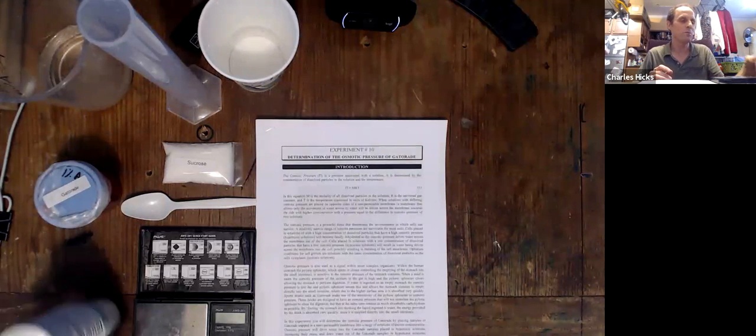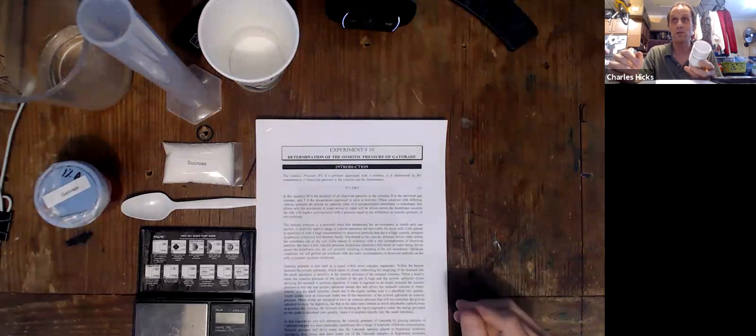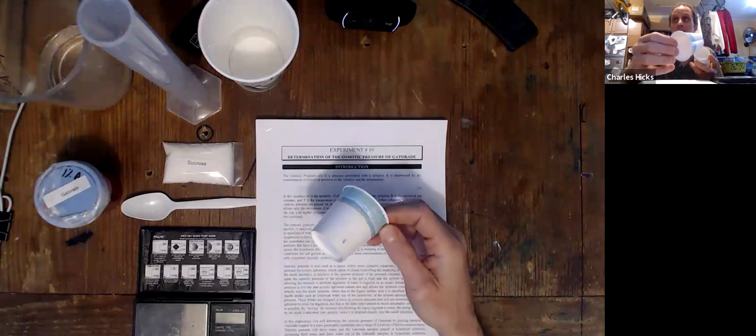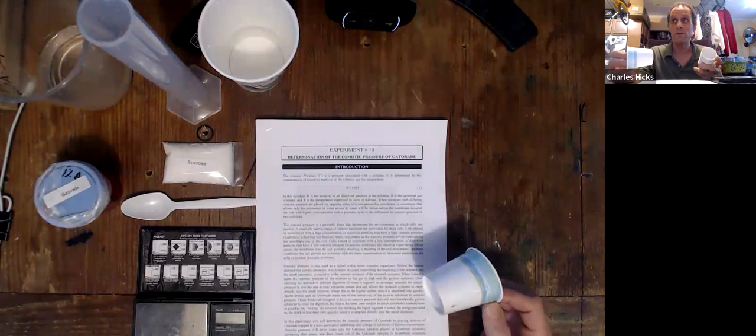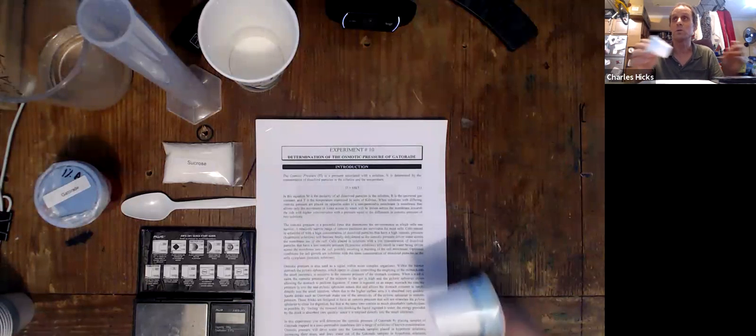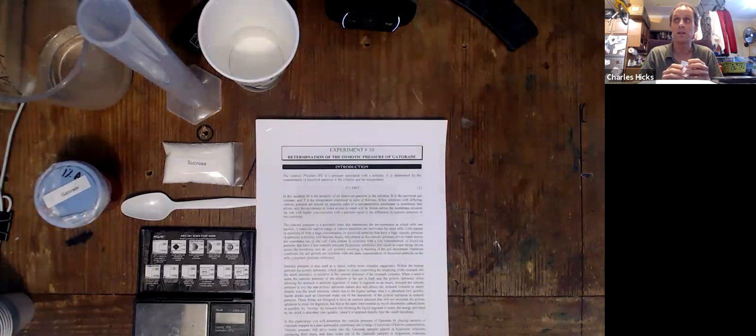In the next part of the experiment, we have to prepare 10 sucrose solutions that have different percentages, and we're going to do that inside of these Dixie cups. I'm only going to demonstrate one of them, but the procedure is the same for all 10 solutions. We have to prepare 10 solutions that are between 1 and 10% sucrose.